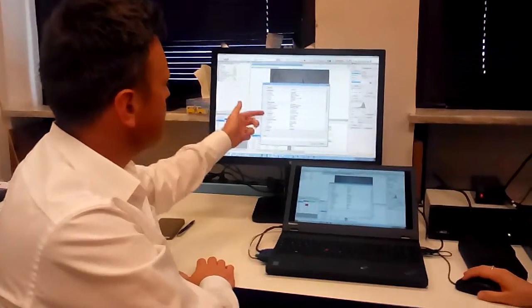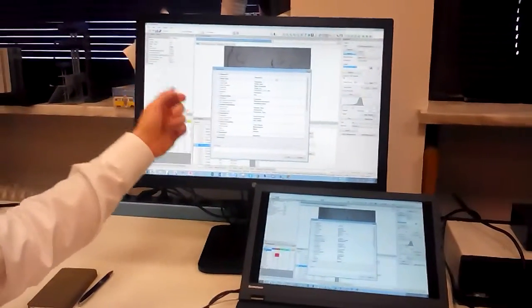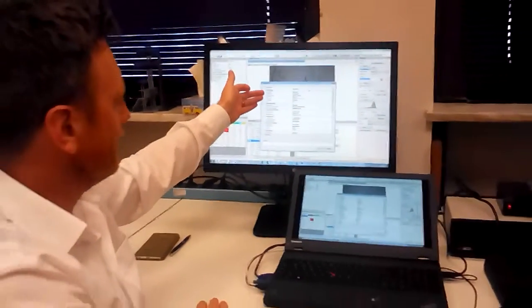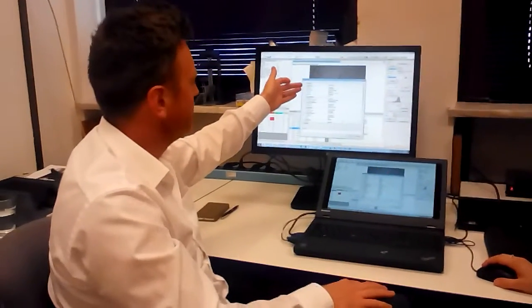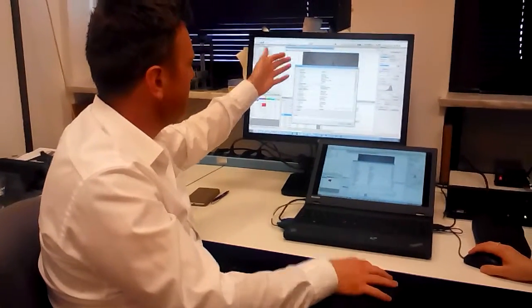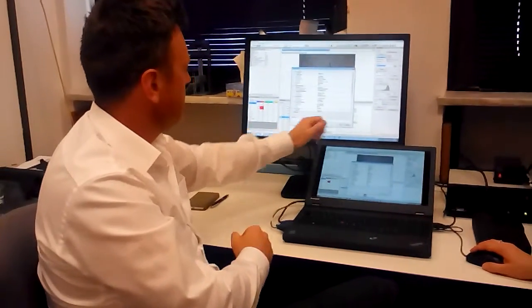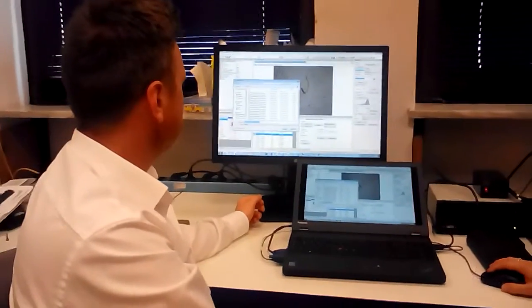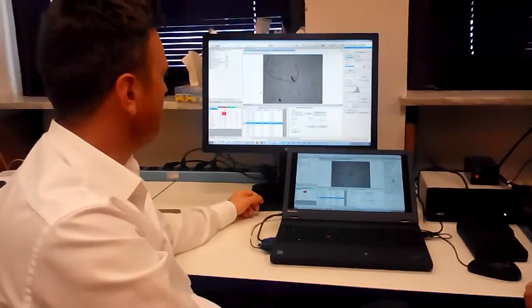So in here, if you wanted to as well, in the report that Karen selected here, there are a number of different fields, and these are all customizable by a user. It, for example, might have your customer's name, your order number with them, and all kinds of other things relating to your order with your customer. It might be an operator, the username, this kind of thing. Anything that you wanted to be included on a quality report. Once you've filled all those in, just confirm, hit the OK button, and look for the directory to save the file. We could save that onto a network or onto the local drive or what have you.